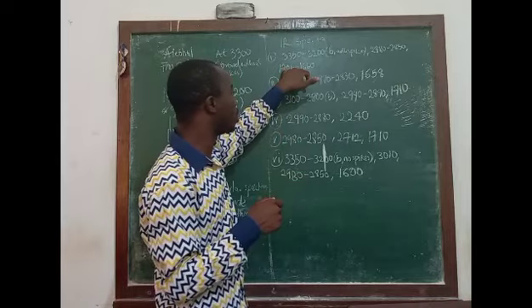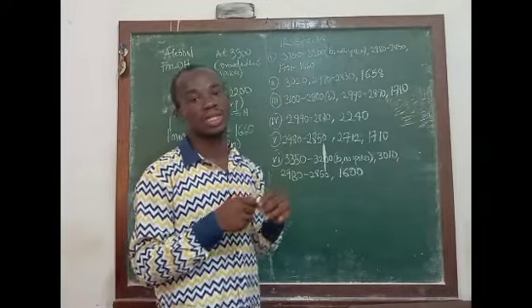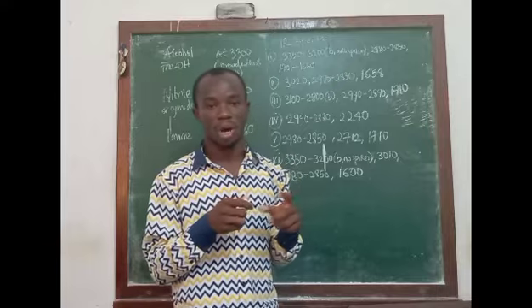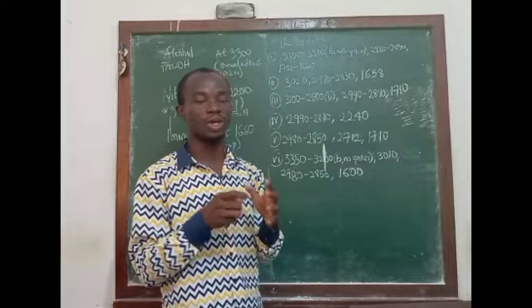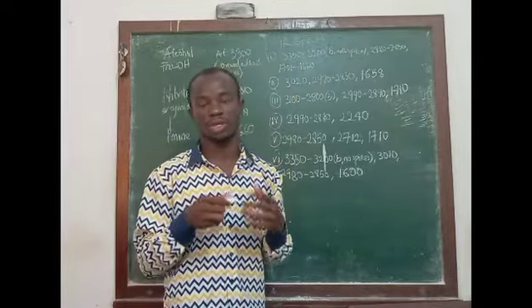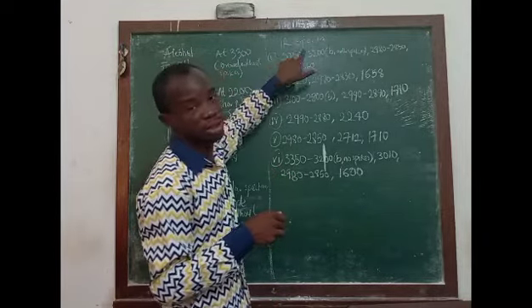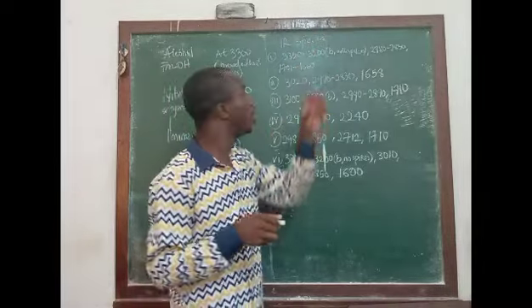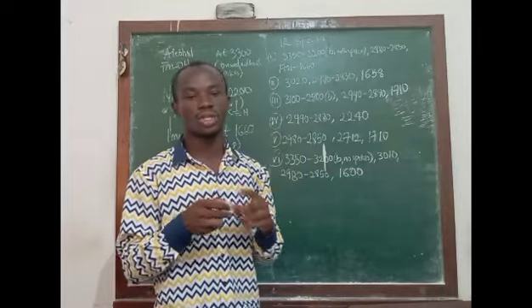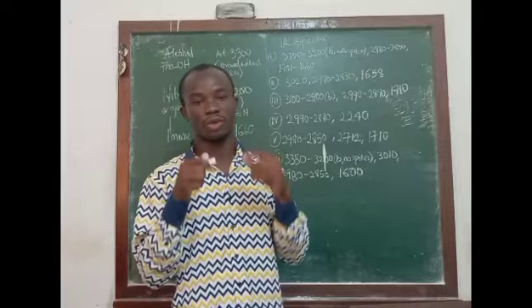What else can we see there? We see a signal at around 1,700 and 1,660. Now this signal is certainly for what? For carbonyl signal, because I told us that carbonyl signal can be found around 1718. But in some cases it can fall a little bit below that particular region, probably for conjugation reason or mesomeric effect reason. At the same time, we also have a signal between around 3,350 and 3,200. It's a broad signal with spikes, and from what I had said earlier, a broad signal around 3,300 with spikes represents your NH2 stretching vibration.